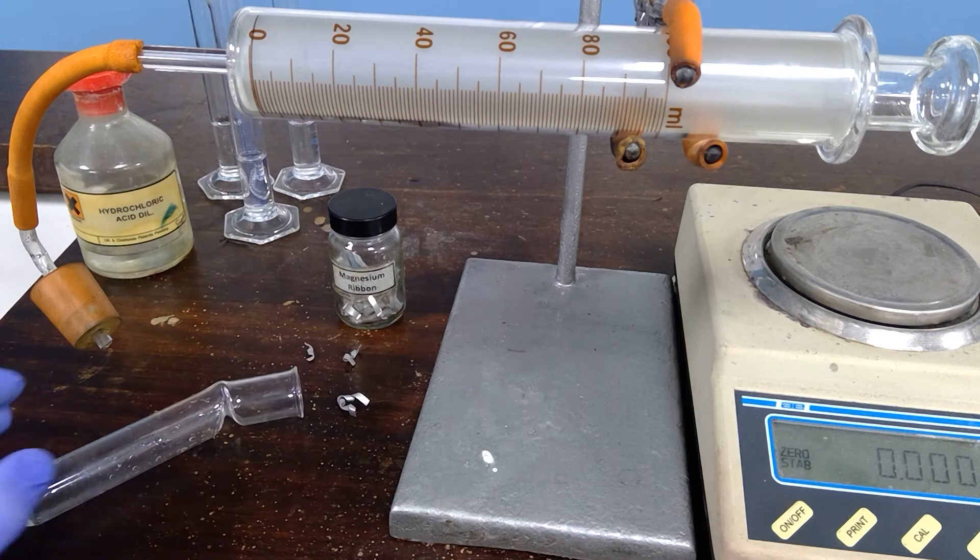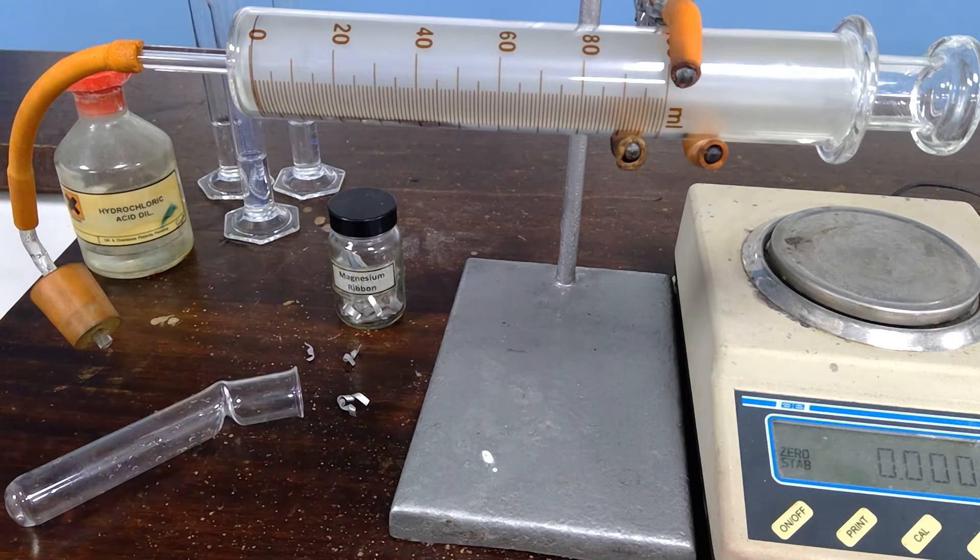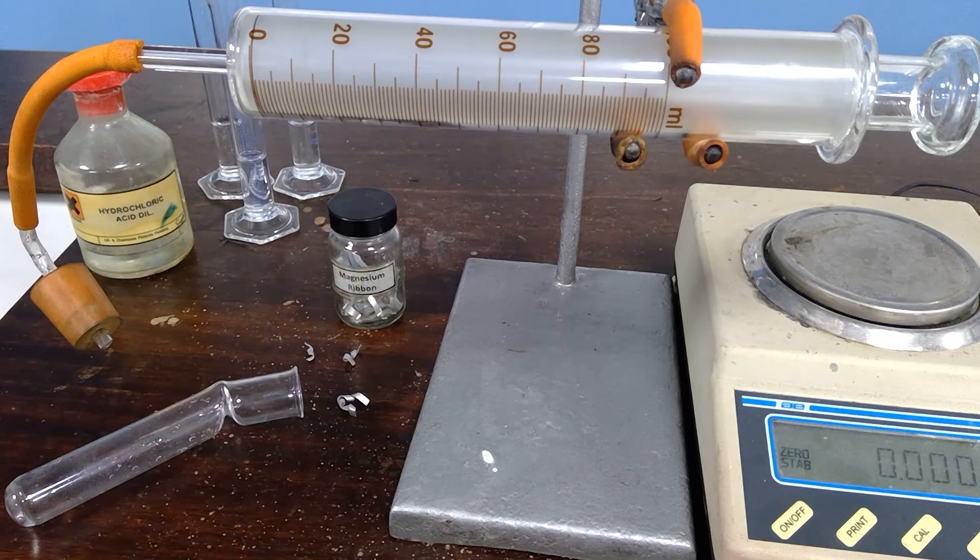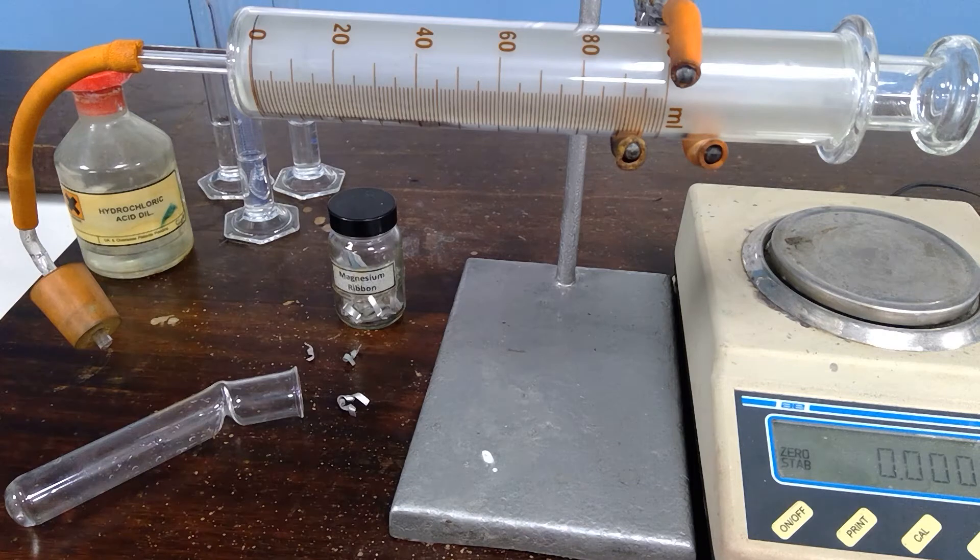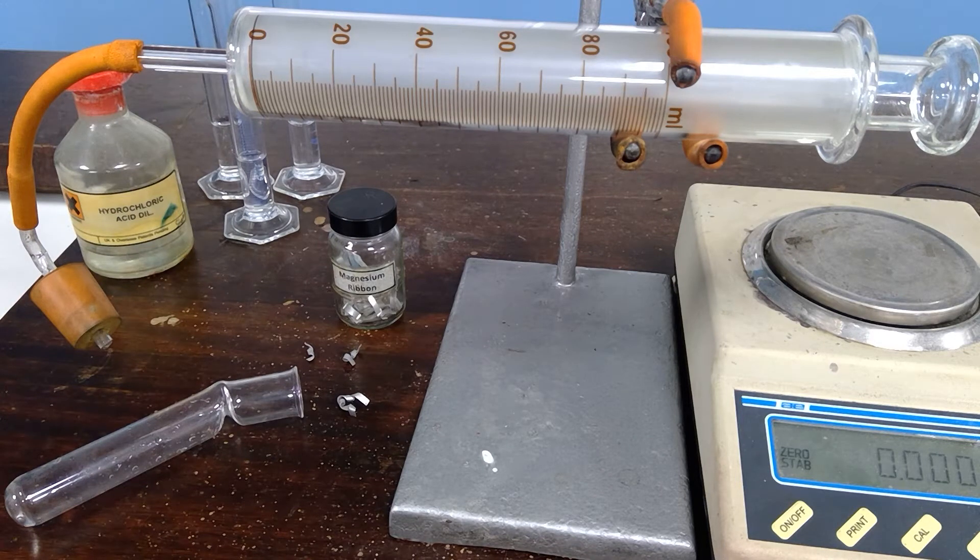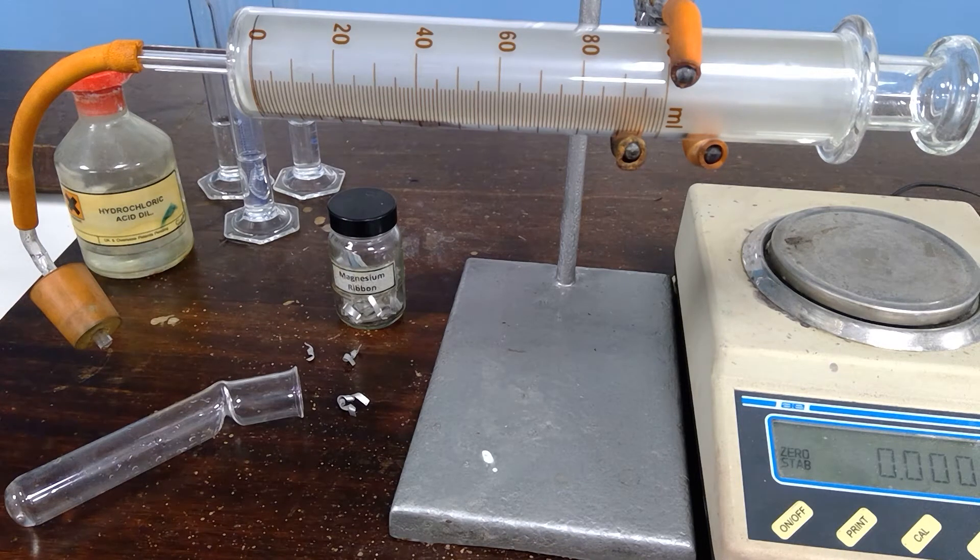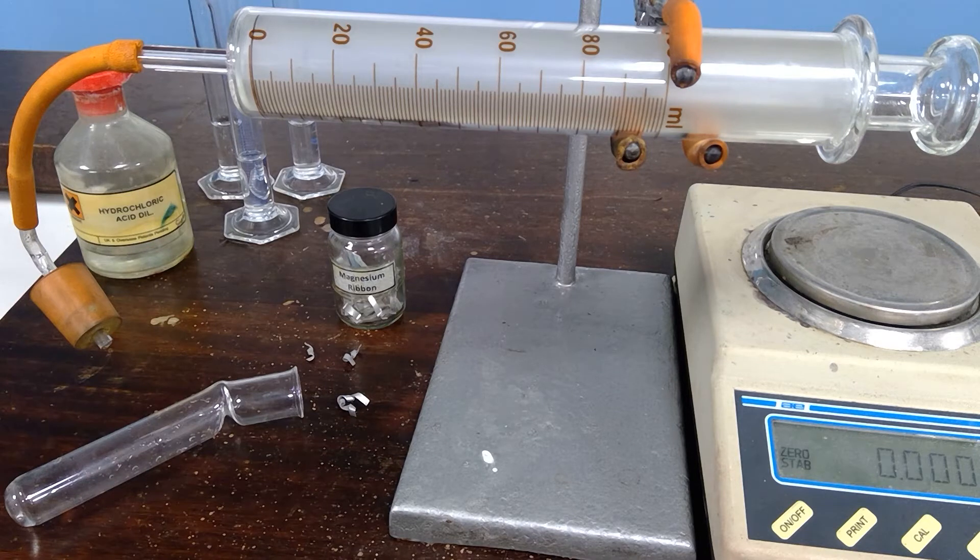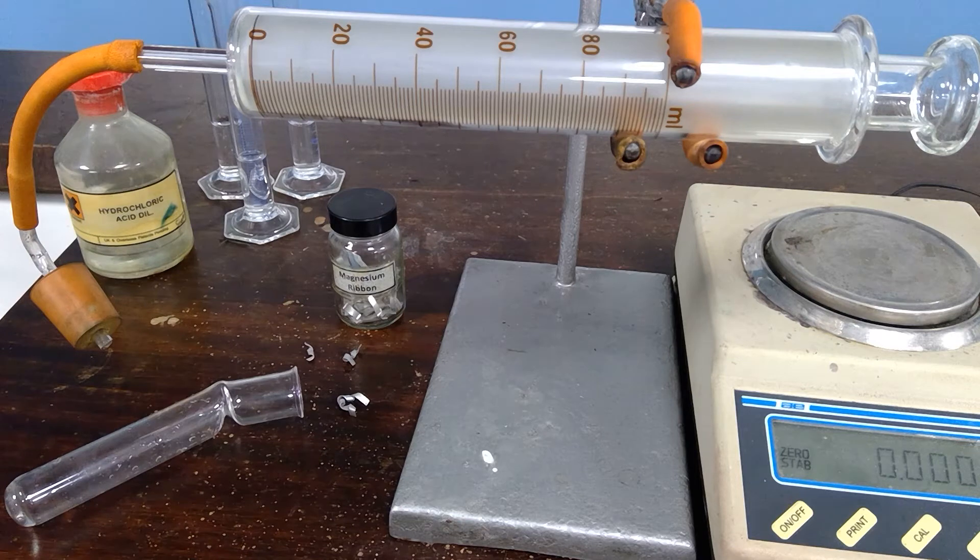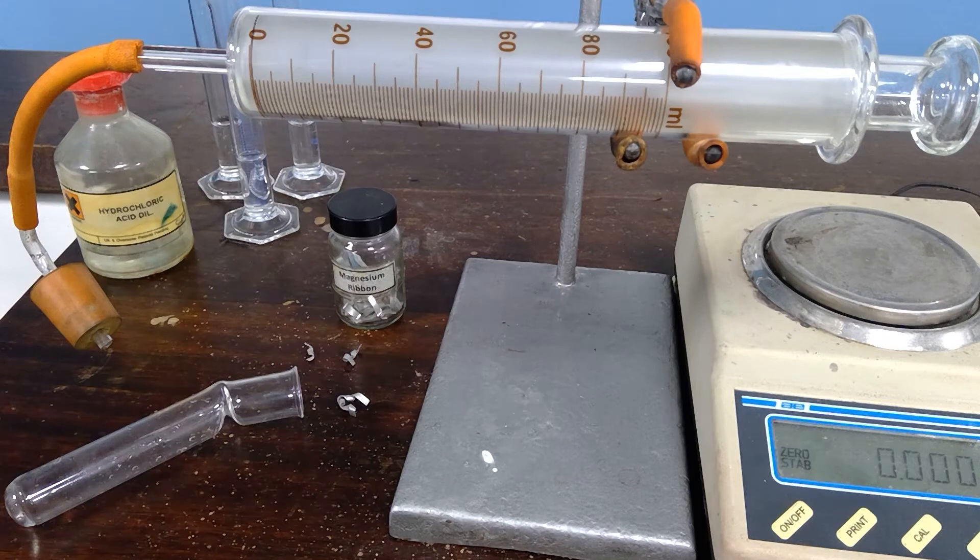Each time the experiment is done, please record the mass of the magnesium, which on this occasion is measured to three decimal places, very sensitive because the mass of magnesium determines the volume of hydrogen. We would not want to exceed 100 cm cubed or 100 mils as this gas syringe indicates. Cm cubed is the same unit size as a milliliter.